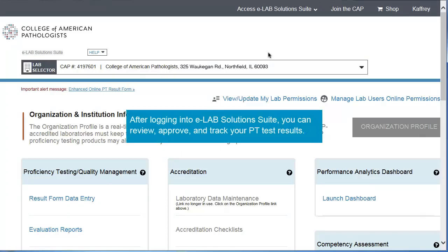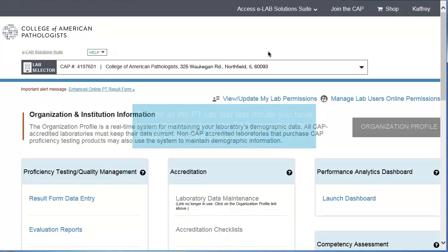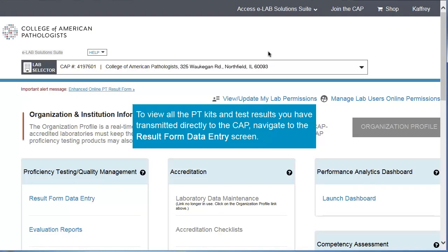After logging into eLab Solutions Suite, you can review, approve, and track your PT results. To view all the PT kits and test results you have transmitted directly to the CAP, navigate to the Result Form Data Entry screen.